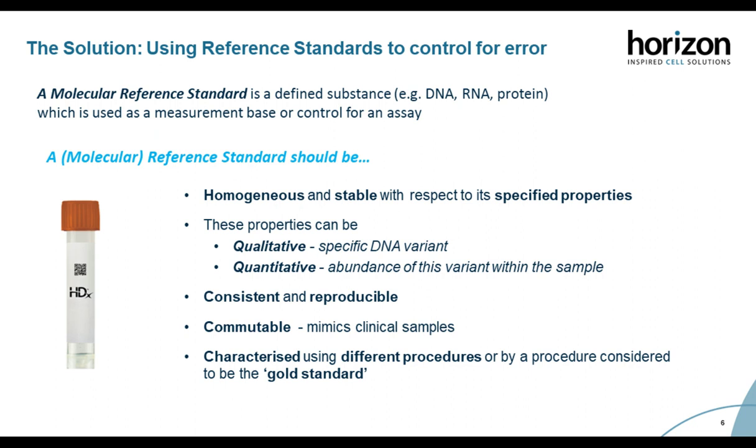The solution to controlling your error rate in NGS is to use reference standards to monitor every step of the process. A molecular reference standard is a defined substance, either DNA, RNA, or protein, which is used as a measurement base or control for an assay.